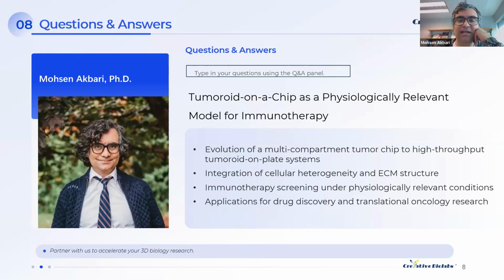And at this stage, anything that is suggested by the 3D models has to be tested in animal models, including nude mice, of course. But we are thinking about optimizing or improving the efficiency of the screening part, which traditionally relied primarily on 2D culture systems, which are not true representatives of the 3D complex environments that we see in our body. I'm not sure if I answered your question.